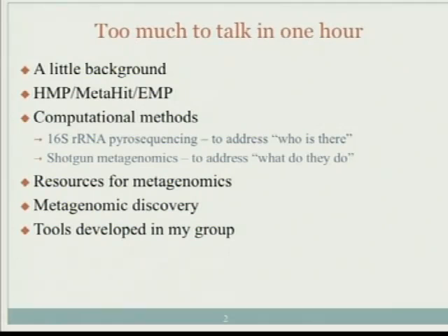What are the methods that are required to analyze those metagenomic sequences? But whenever we talk about methods, you need to know what you care about in a whole community of microbial organisms. So if you only care about what those organisms are, so it's E. coli, it's streptococcus, so you just want to know the taxonomic information from the metagenomic data set, probably you will do different experiments. You will only get 16S RNA gene fragments from those samples, and then you will do some analysis of those 16S RNA gene fragments.